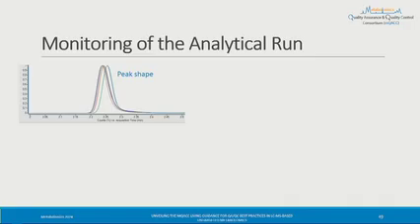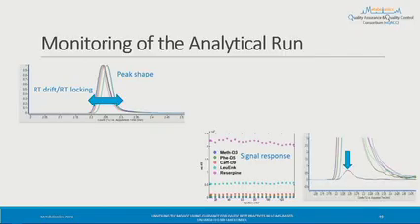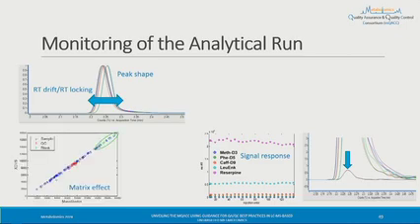And then just to show you some of the examples of how internal standards are being used by community. So one way is looking at retention time drifts or calculating retention indices. Another way is looking at signal response, so monitoring is everything working okay with a particular study. Another way, especially if they are spiked post-extraction, could be to monitor matrix effects.